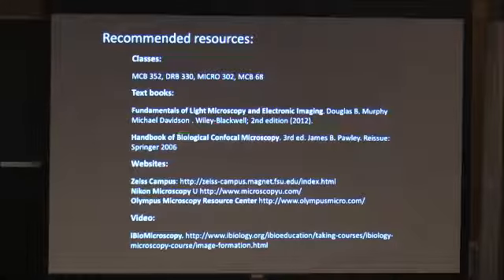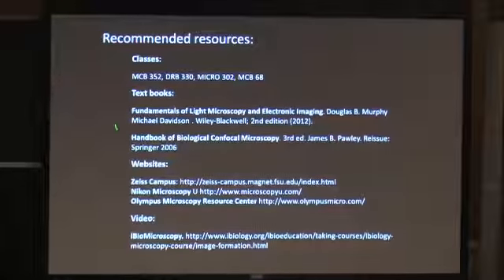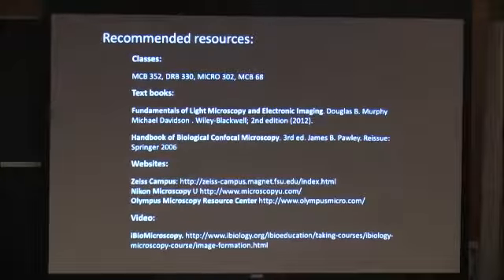There are a couple of good textbooks out there. This one by Murphy and Davidson came out a couple of years ago, and it's a really great textbook. It goes in conjunction with Mike Davidson's website. Like you've probably seen, it's called the Molecular Expressions website, which has now been picked up by all the major manufacturers. If you go to Zeiss, Nikon, and Olympus, they're all using Mike's slides and images. This one's a little more complex and more specific to confocal microscopy. This is James Pawley's famous textbook. It's really thick, really good, with lots of information there.